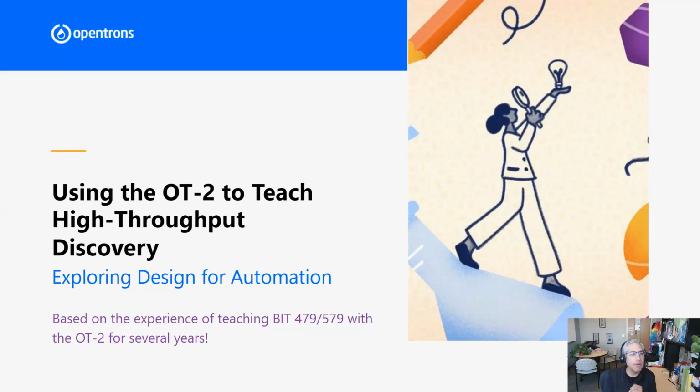I really try to emphasize in our biotechnology classes that high throughput discovery is something that can and should occur in undergraduate and graduate molecular biotechnology education. And we can do that by exploring the design for experiments that require automation. And this is all based on the experience of teaching this class, Biotechnology 479, 579, with the OT2 for several years now.